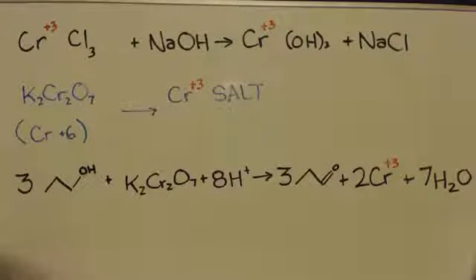So let's say I use some of this dichromate, right? You can see the only metal cations that are put in here is chromium and potassium, and that's both from potassium dichromate. The whole secret to the success of this is that you only have potassium and sodium metal ions in your crap solution, okay, that you want to recycle, okay? If you have any other metal cations, it could screw things up, okay, and I'll tell you why later.